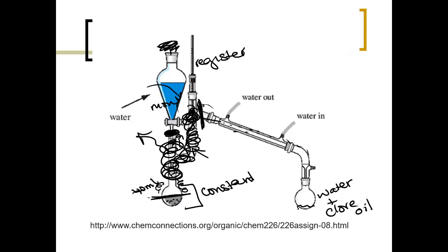Now, what's in your water bath or your sand bath, in this case it's a sand bath, will keep everything warm as long as your mixture is in the sand. Some of you tend to put your stuff on the top of the sand, and if you do that, it's not going to heat evenly or correctly. We also want this to always, always, always have water. And this has happened only once since I've been teaching, but if you run out of water, the glassware can shatter.